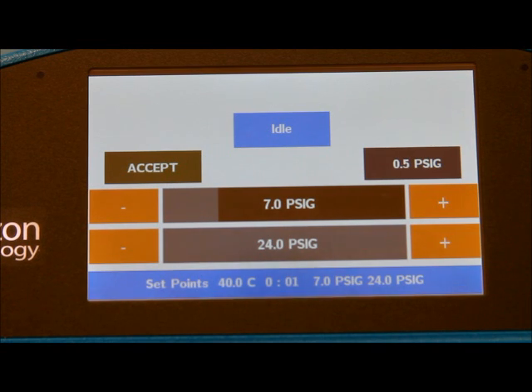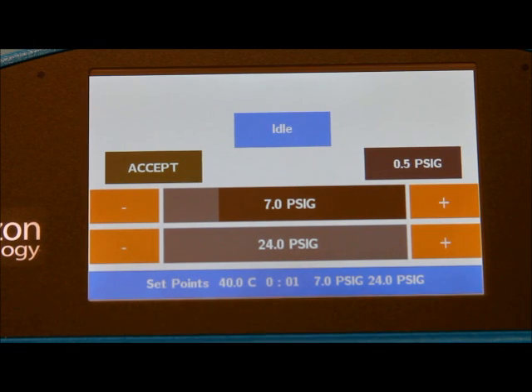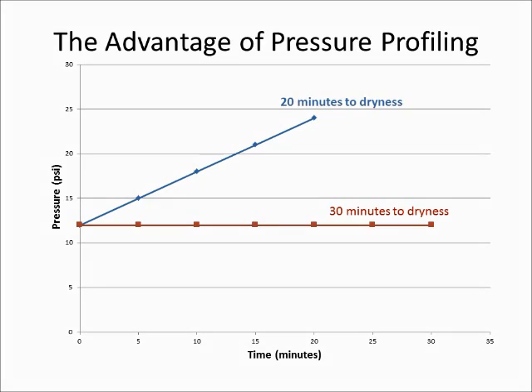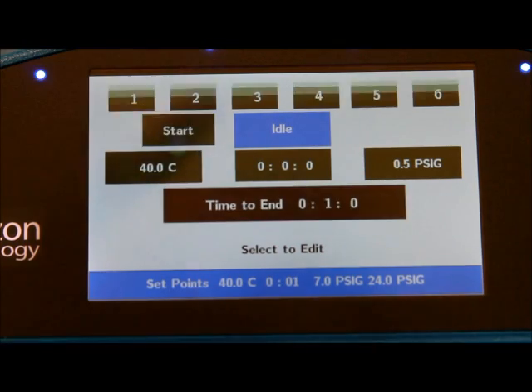One of the most amazing things about this software is the pressure profile. In some older models, you may see technicians frequently checking on the sample volume and adjusting the dials to increase the gas flow as time goes on. Here, the pressure ramp is entered into the software, and then you can walk away during the extract evaporation and leave the system unattended until the audio alarm goes off to tell you the samples can be transferred to the analysis instrument auto-sampler. The advantages of pressure profiling: no splashing or splattering, no user intervention, and, best of all, faster drying. We'll accept the pressure profile we have in place and start the system.